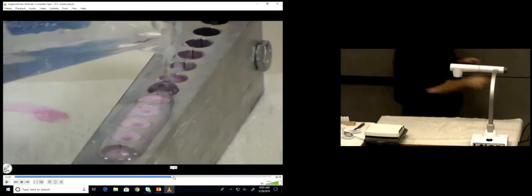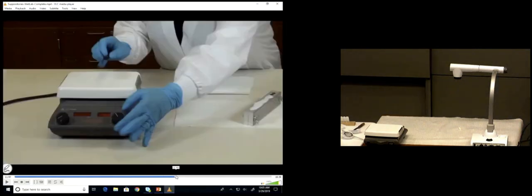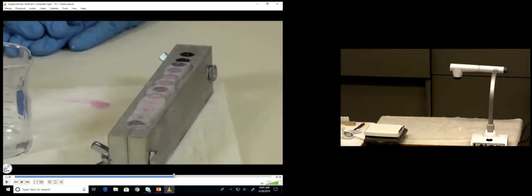I can't emphasize that enough, because when she's done and we set that aside, what's going to happen over time? As it solidifies, it will contract. And as Judy talked about, that's where those holes come in. If you just fill it to the very top and don't overspill it, it contracts down below the cavity. I'll take your word for it, it was at the top when you poured it, but by the time you're done, it's below the top of the cavity, at which point your suppository is underweight and doesn't have enough drug in it. So we want to make sure that it spills out and over.